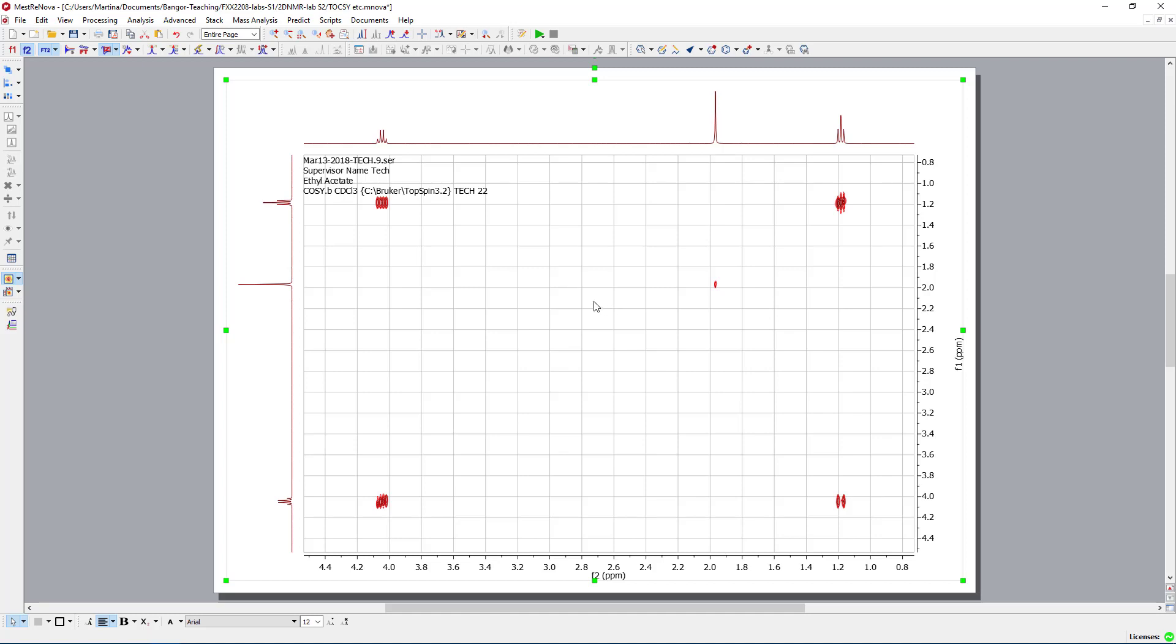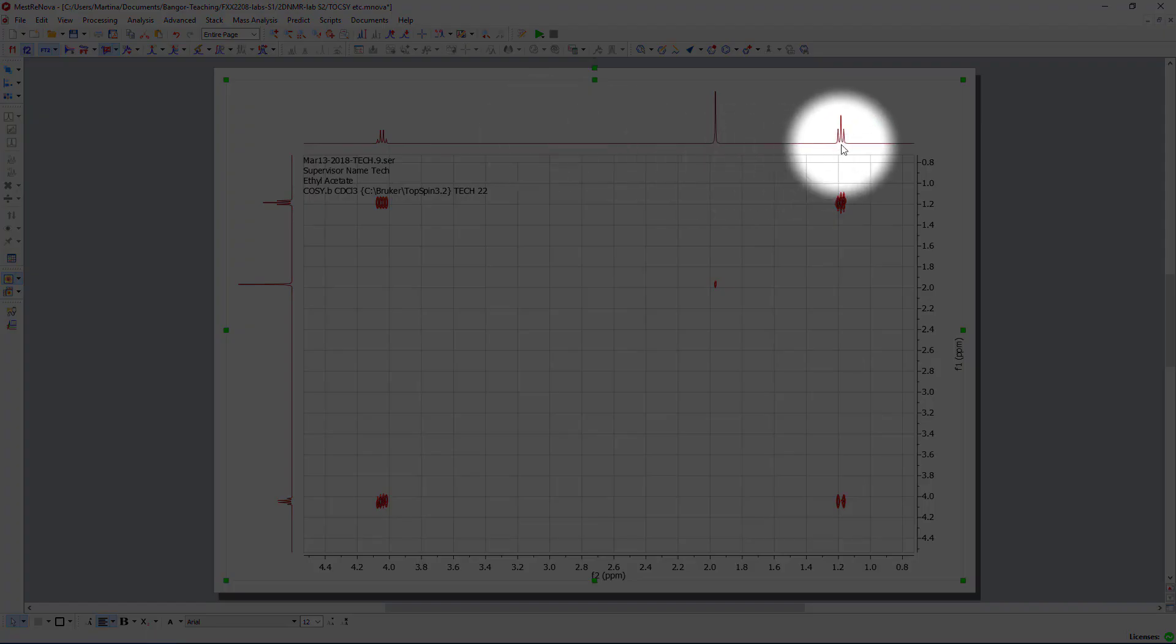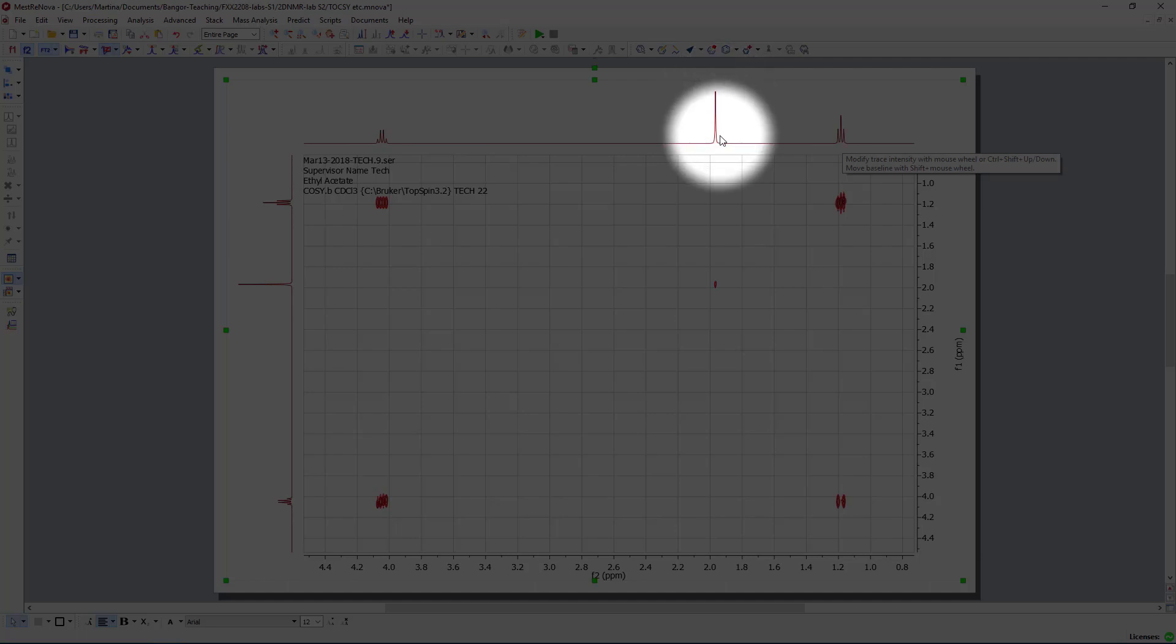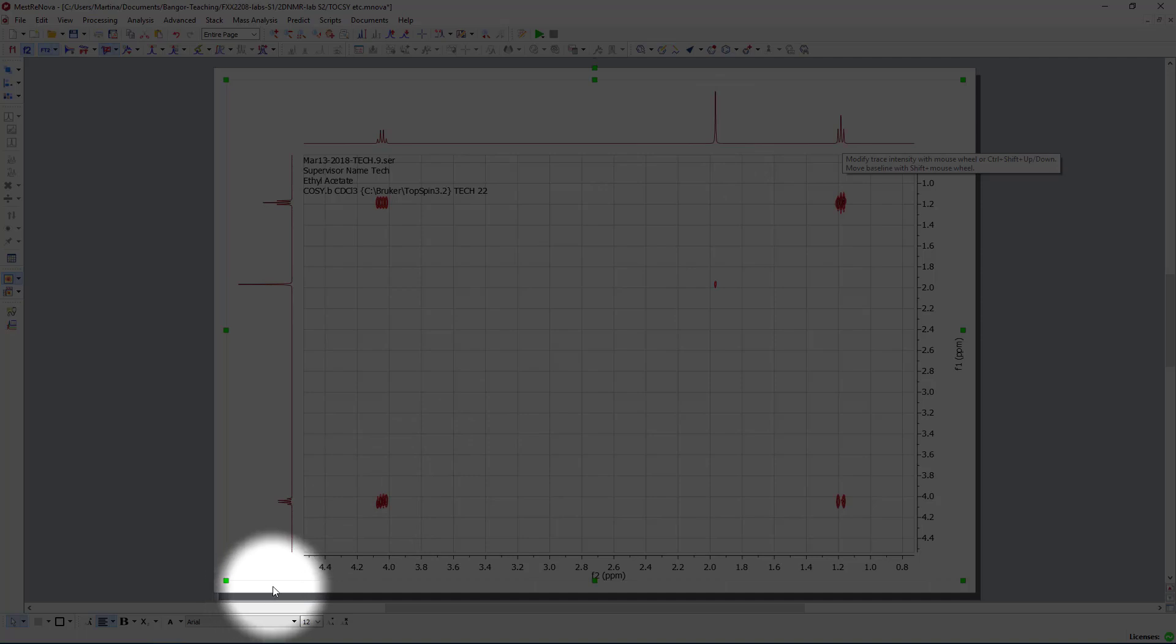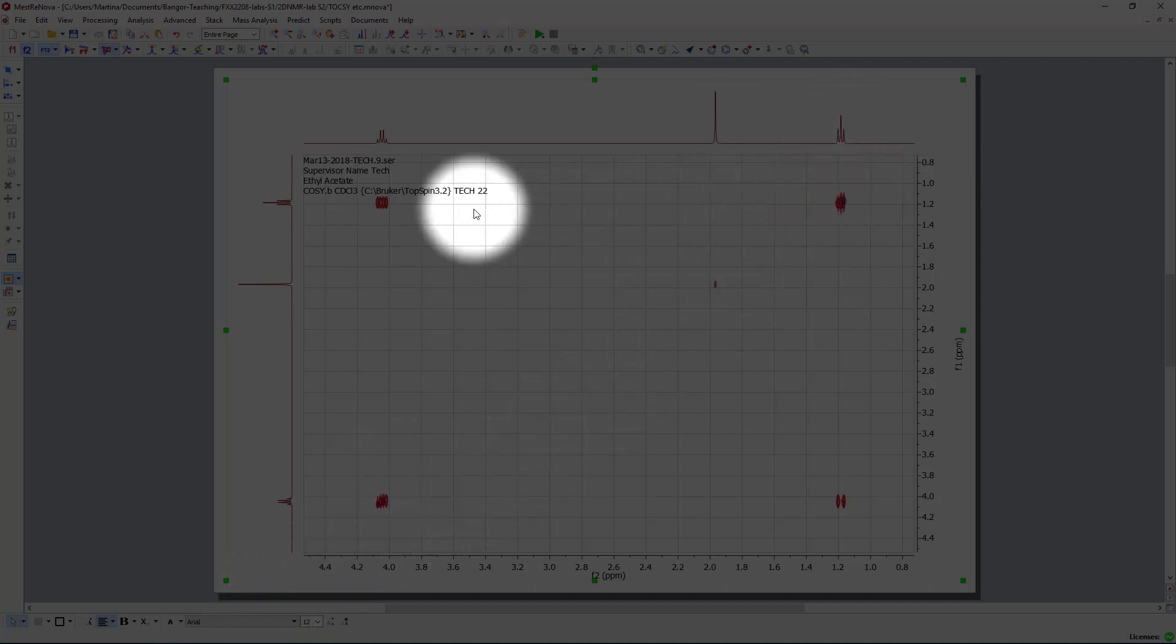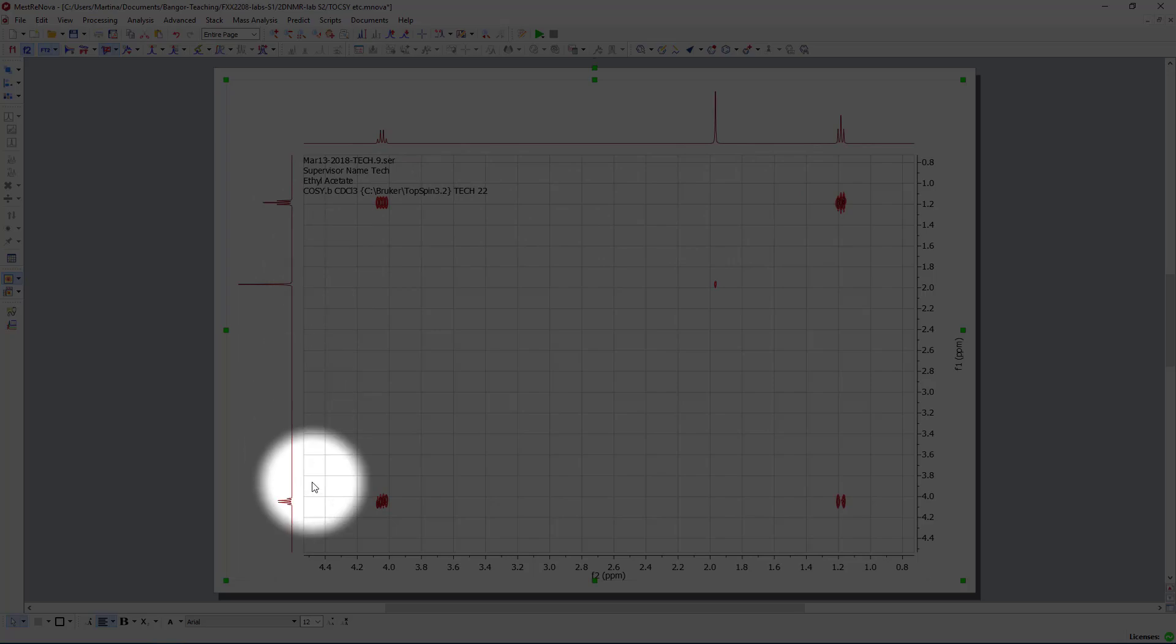Ethyl acetate is a very simple molecule, so we have our ethyl group over here. And this one here is the methyl group which is sitting on the ethanoic acid side. Again, we see the diagonal, so each signal is correlating with itself, as expected.